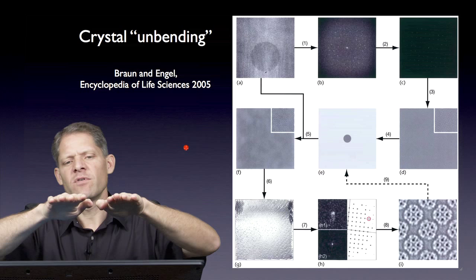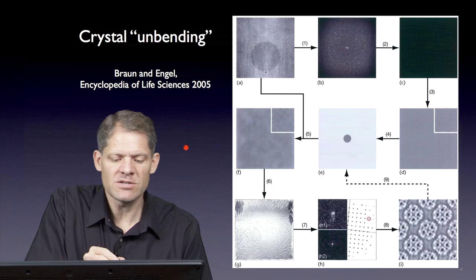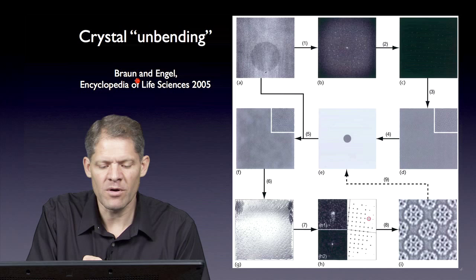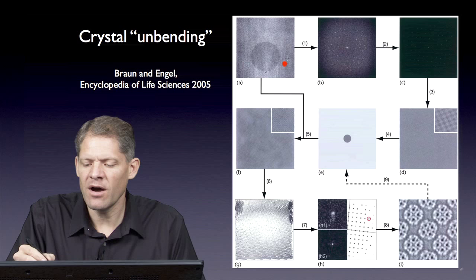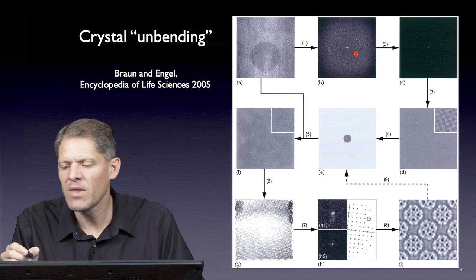What has been observed is sometimes these 2D crystals have distortions and bends within them. Fortunately, some of this can be corrected through image processing. This process is called crystal unbending. Here I'll show a figure from Braun and Engel that illustrates this. Given an image of a two dimensional crystal, one can then calculate its Fourier transform. If you look, you see the individual spots in the diffraction pattern.